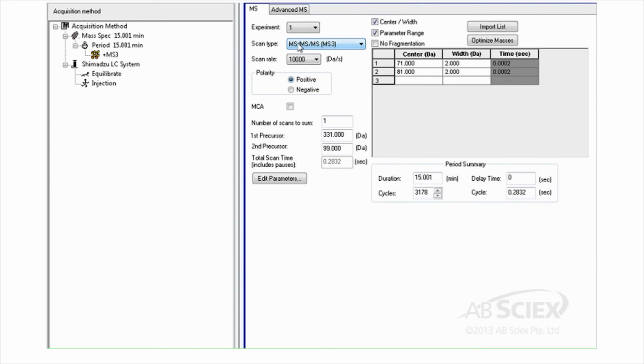As you can see, once you know the second-generation ions you want to monitor for your compound, creating an MRM cubed acquisition experiment can be an easy upgrade from your pre-existing MRM acquisition method.